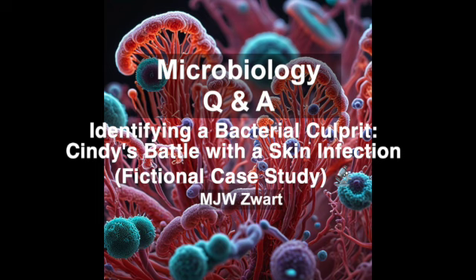This is getting exciting. We're getting closer to identifying the culprit. To confirm their suspicions, the lab decided to perform a gram stain. The gram stain. I remember hearing about that. What exactly is it again? It's a staining method that helps distinguish between bacteria based on the structure of their cell walls. You see, bacteria can have either a thick, sturdy cell wall or a thin, delicate one. The gram stain basically highlights this difference.